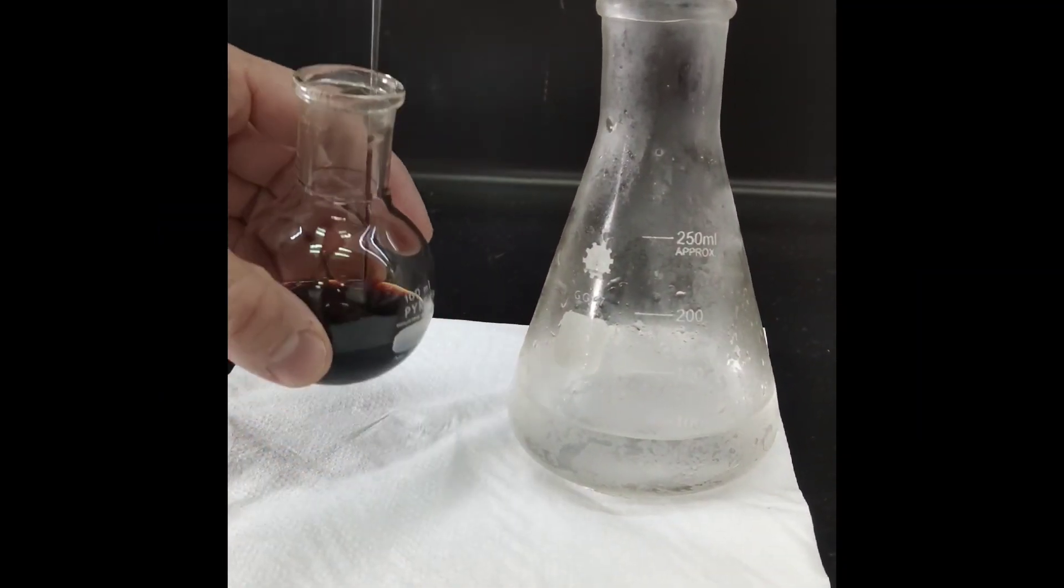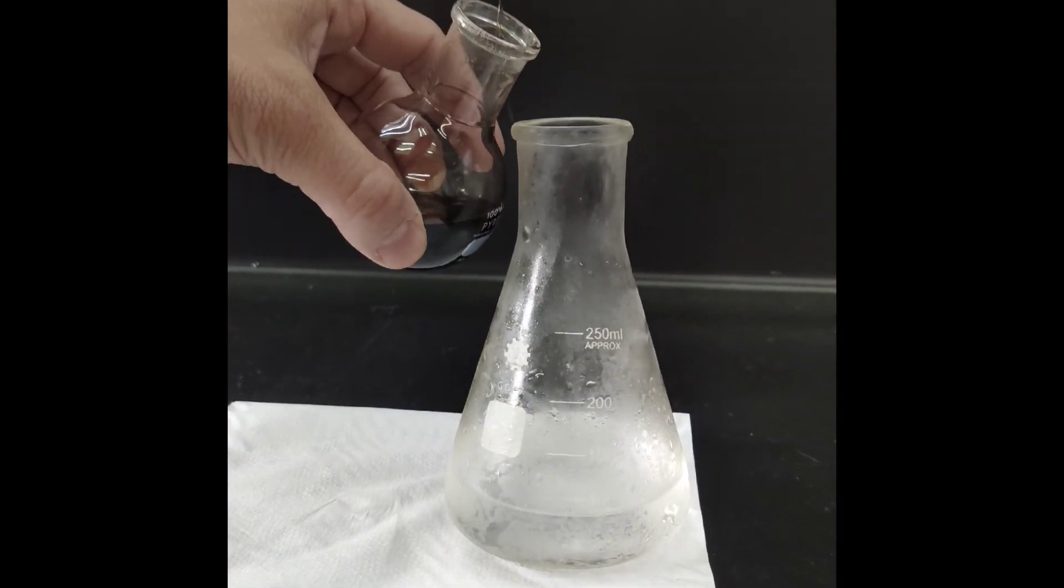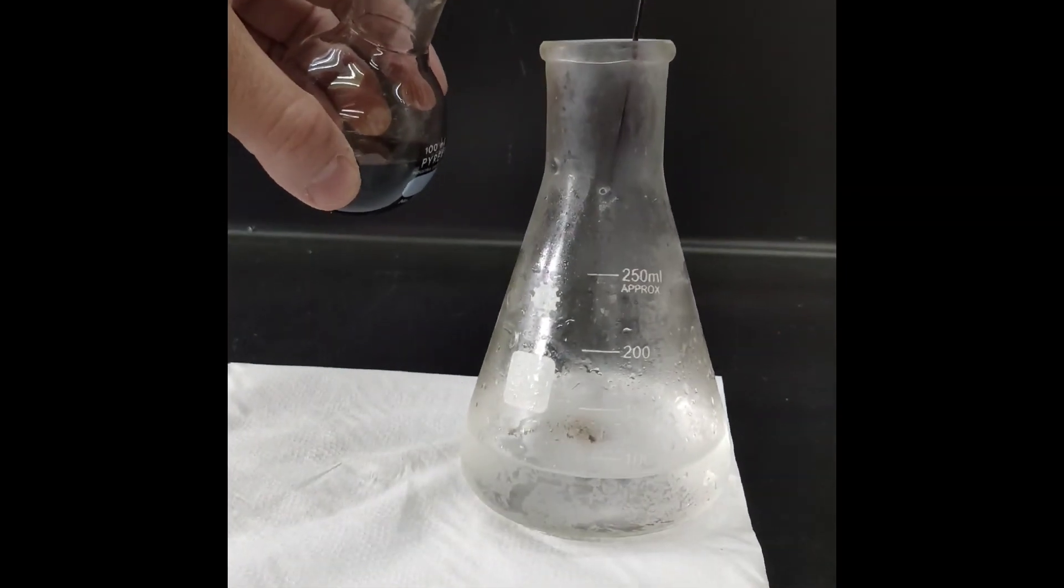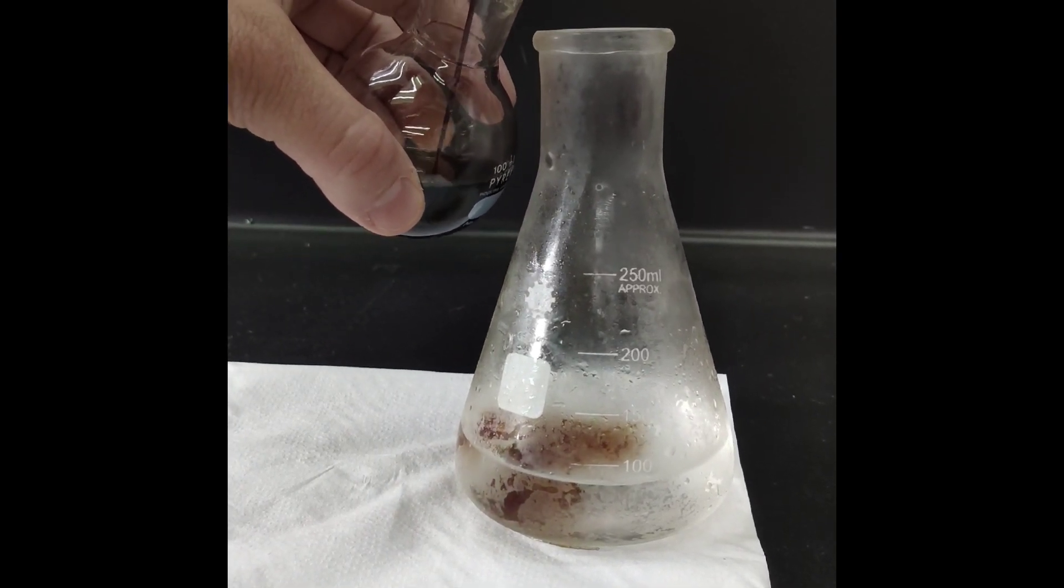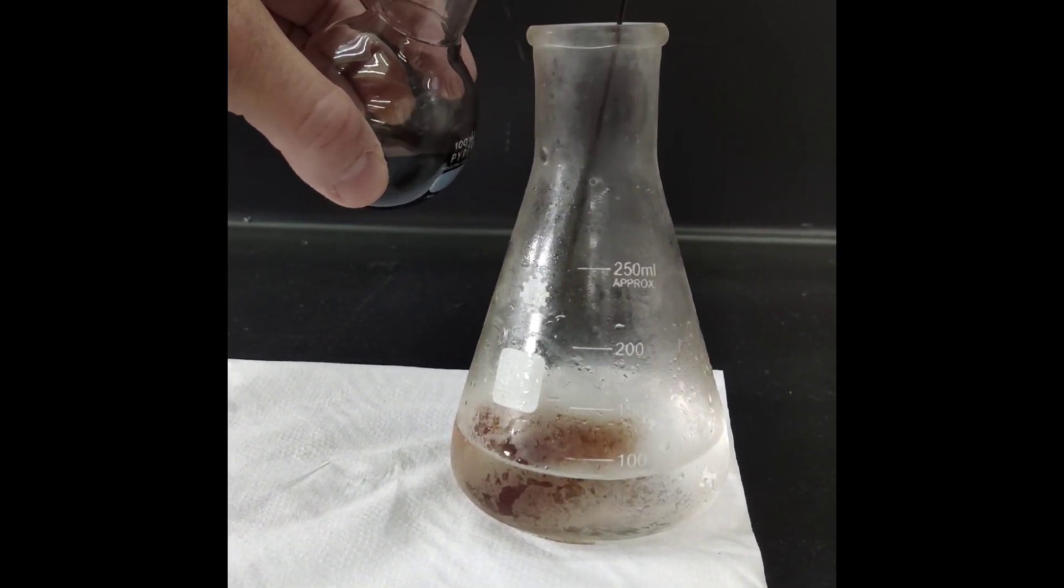We pour the content of the reaction flask onto the brine using a pipette. We can see that a brick red precipitate forms almost instantly.